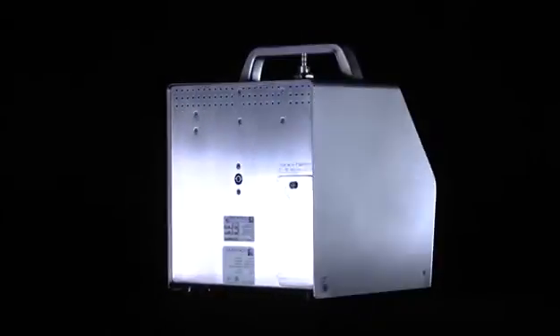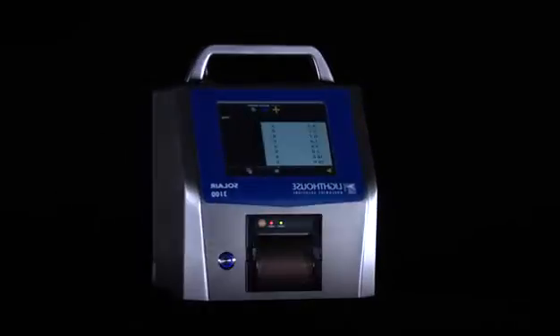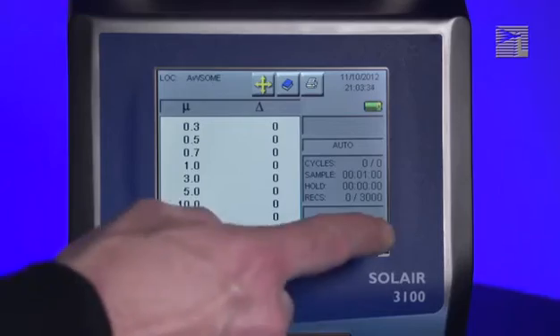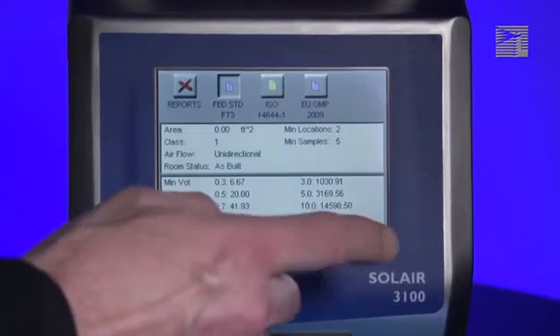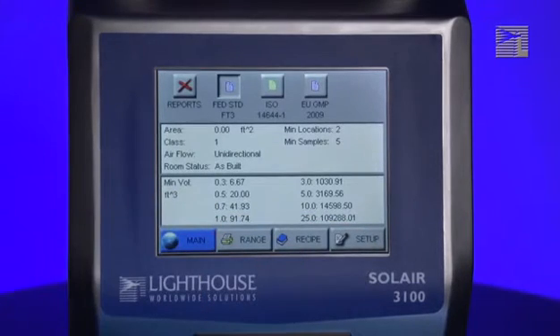In this tutorial we will cover the reports function in the airborne line of particle counters from Lighthouse Worldwide Solutions. To get started, press the Reports button at the bottom right corner of the screen.